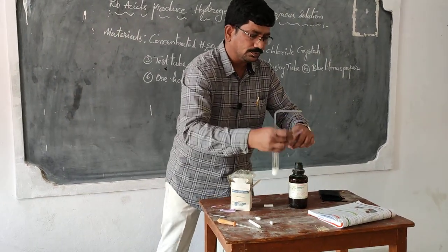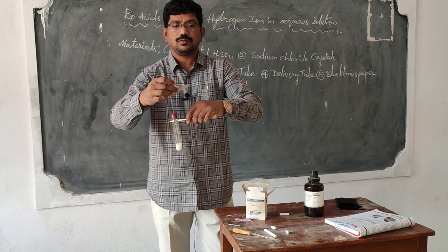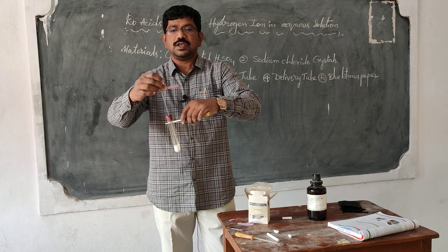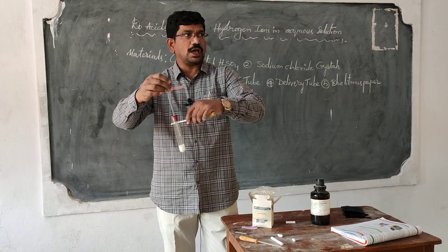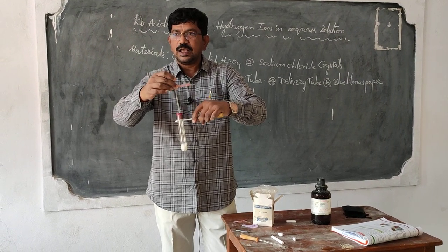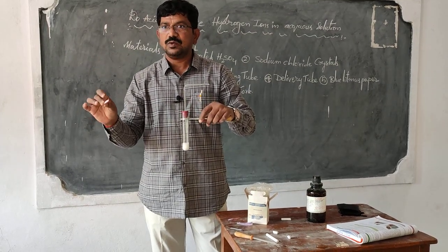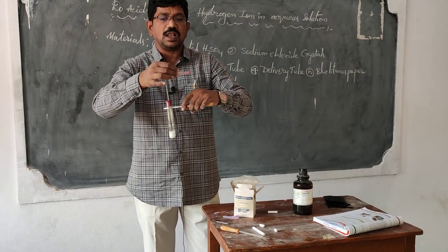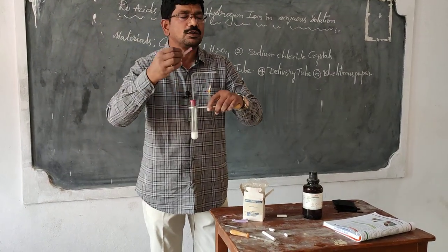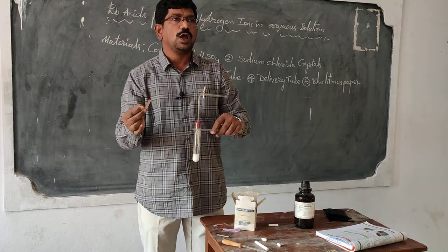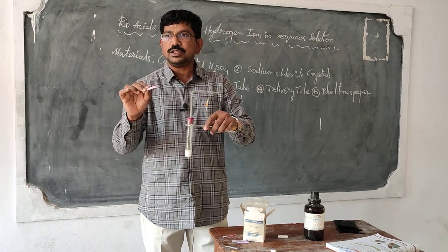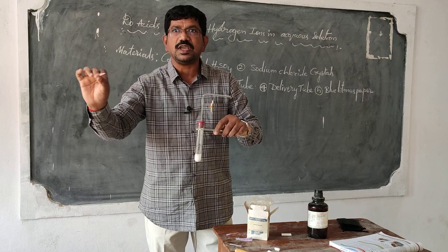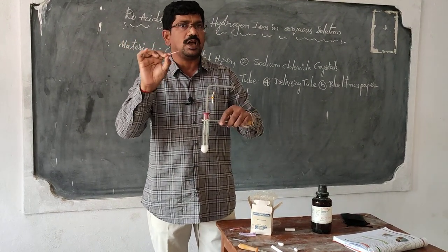I am dipping the litmus paper in water. See the change in color — it turns red. Blue litmus turns to red. With this, we can say that in dry HCl there are no ions. When the litmus paper is wet, the HCl gas dissociates into its constituent ions — H+ and Cl−. So with this experiment, we can conclude that for the dissociation of acids, water is needed. Dry HCl does not have any H+ ions because it doesn't turn the blue litmus.